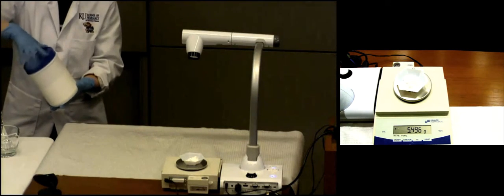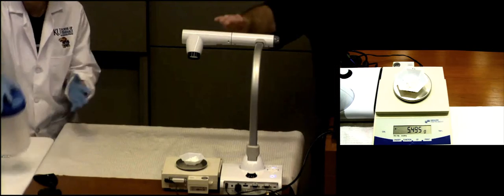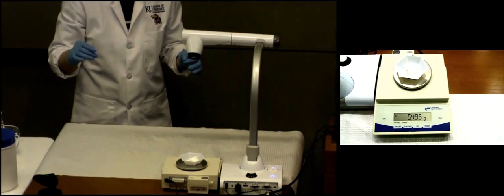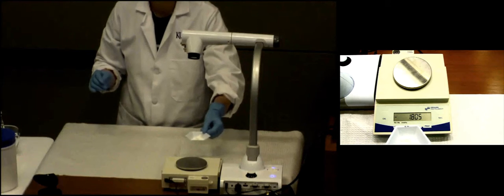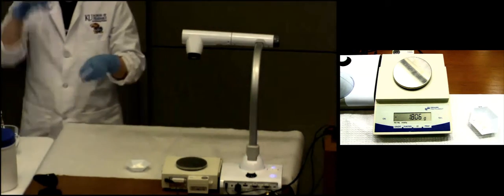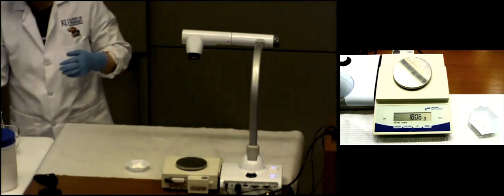All right, while you're writing down numbers, I measured my first product. The first one is cornstarch. The actual weight is 5.495. Pay attention to my label. It says cornstarch there. For me, as a single person, I use a whole bottle, right? But you guys need cornstarch initial, cornstarch final, because you need to get it from the dispensing area first.